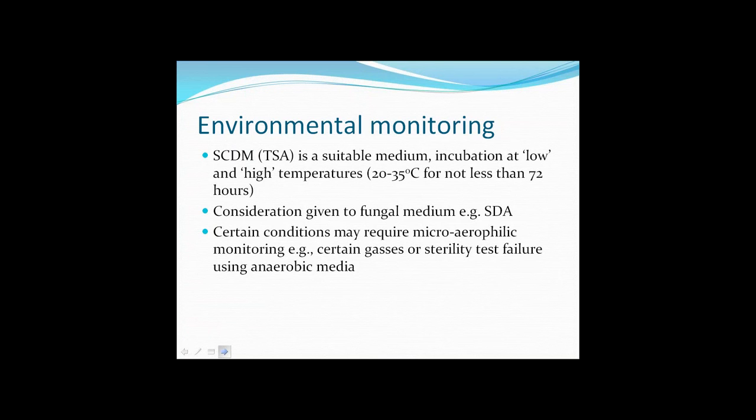Whether an organisation should go with one or two culture media is one of the big recurrent debates within pharmaceutical microbiology, and much depends upon the facility microflora and in relation to validation studies.